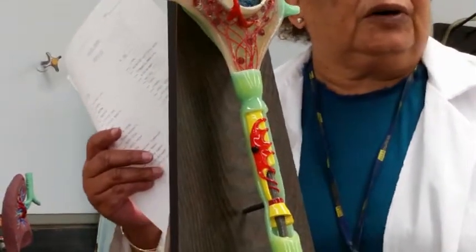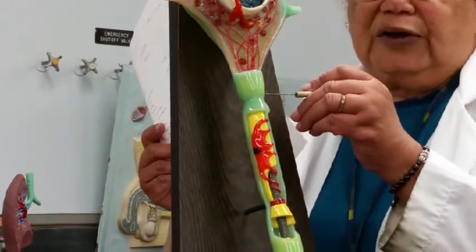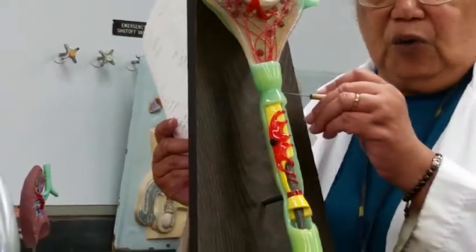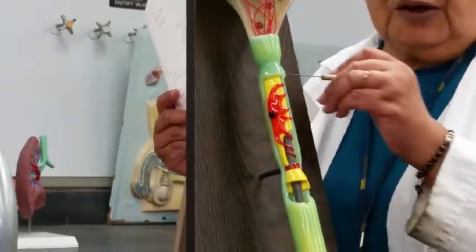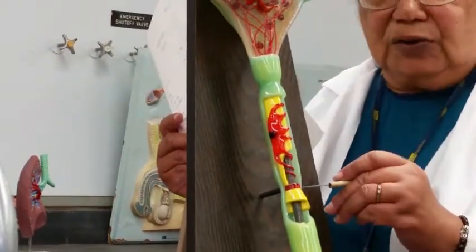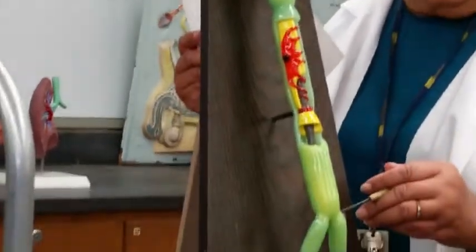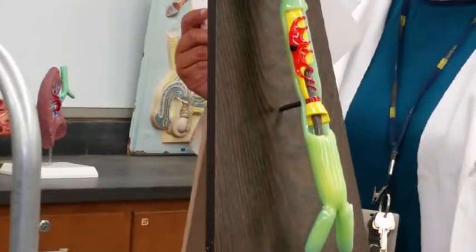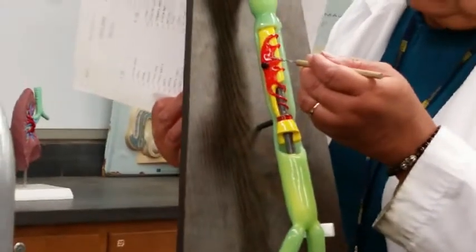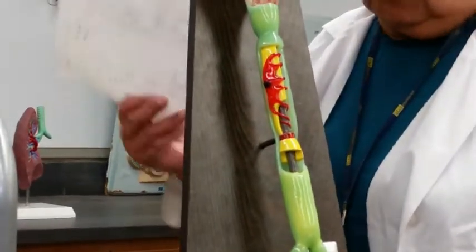And the next item now is the Schwann cell. So here's a little waistband called the node of Ranvier. And here's another one, the node of Ranvier. From one node to the next node, that would be the Schwann cell. Why do we call it a cell? Yes, it is a cell because it has its own nucleus. Here's the nucleus with the endoplasmic reticulum extending from that.